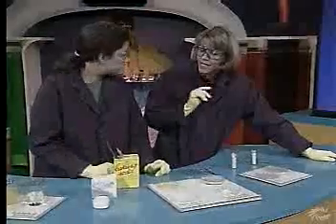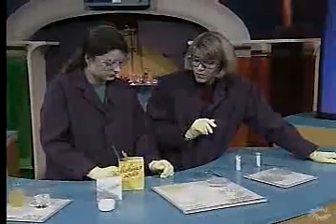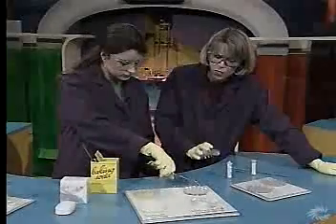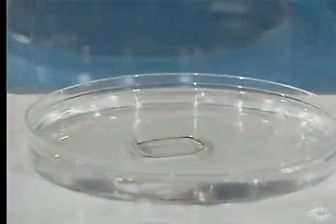Okay, next test. We're going to take an active metal, and we'll use magnesium as our active metal. Place this active metal into our acid solution, our lemon juice. What do you notice when you put the magnesium in? Bubbles and fizz. It looks like it's starting to react. Good. All right, now we'll do the same thing with household ammonia. Put the strip of magnesium in. And nothing's happening. All right, good.